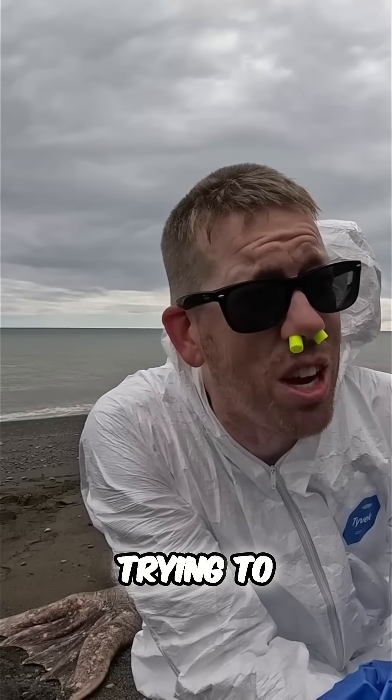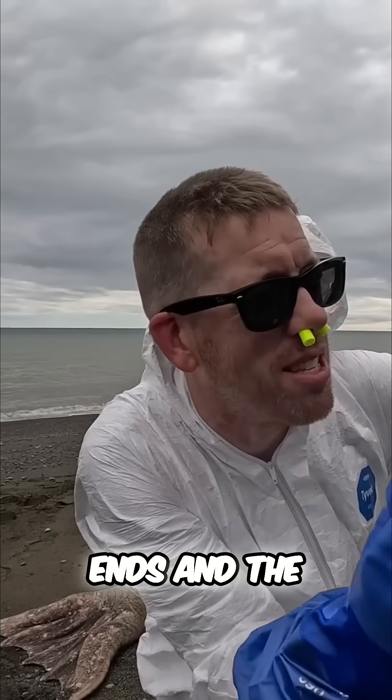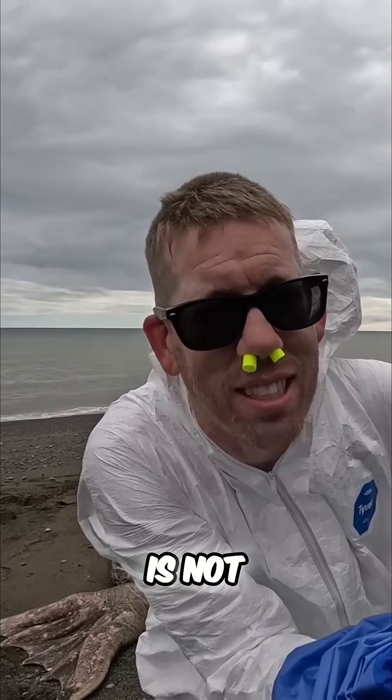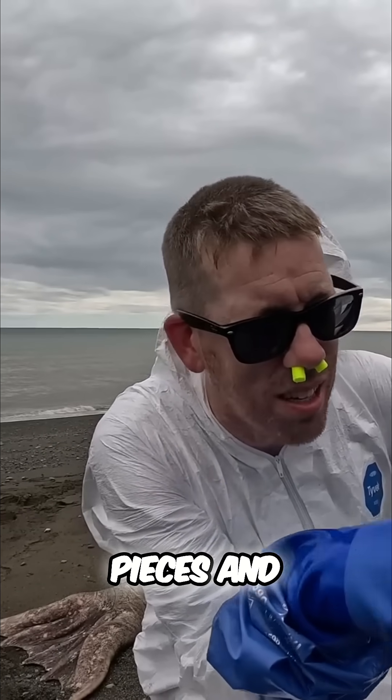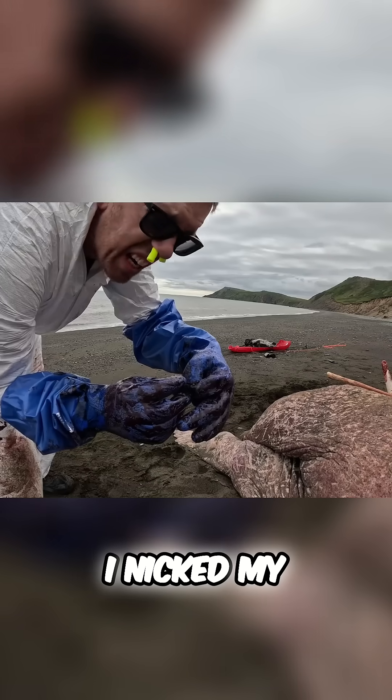Now I'm just trying to figure out where the walrus's neck is. They're just kind of a giant fat tube, and where the head ends and the body begins is not exactly obvious. So I'm having to cut away pieces and kind of search around — it's a lot of work.